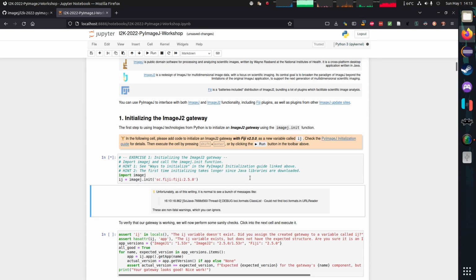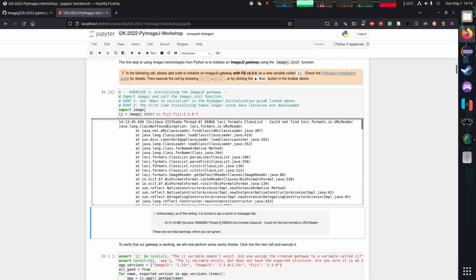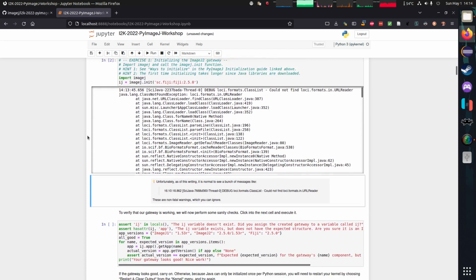The first time that you run this, it may take longer than you see in this video because it is reaching out to the internet to download all of the Fiji libraries and cache them to your computer. I've already done this, so for me it was quite fast. You will also see a bunch of scary messages, as noted in this little idea bubble. These are normal and they're harmless. They're just some debug messages. There's a bug right now where debug output gets turned on when you use Fiji. But it's fine and we'll keep going.